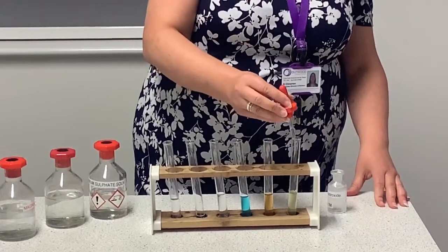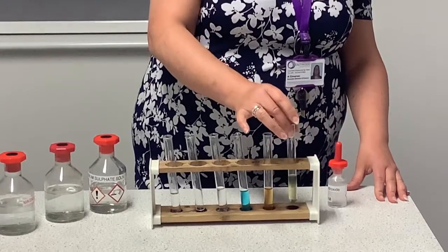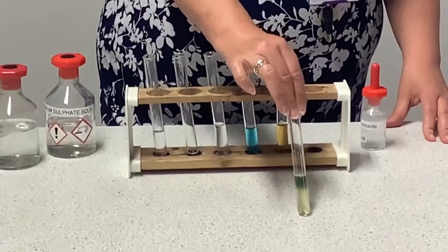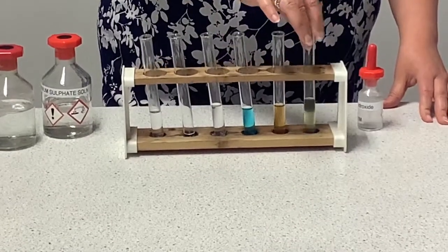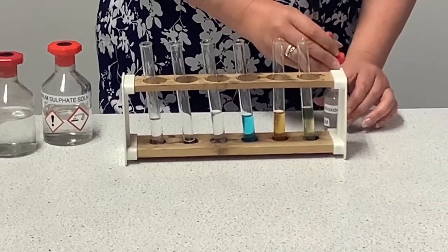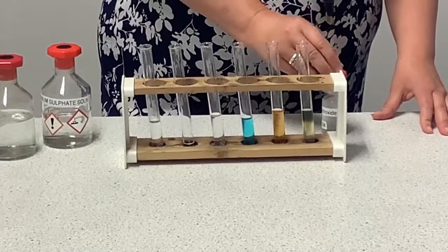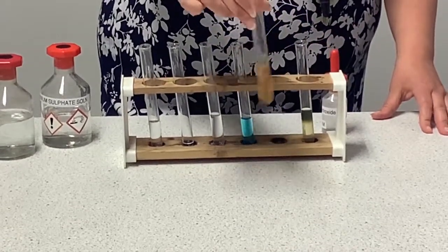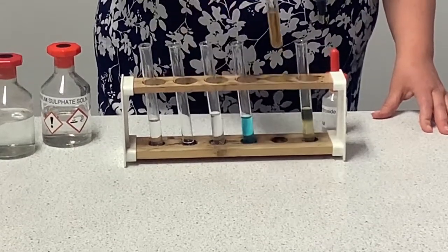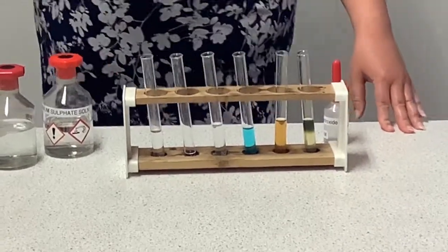So this one is iron 2, and you can see there very clearly that a green solid precipitate is formed inside of the mixture when we've added the sodium hydroxide. That's a positive test for an iron 2 ion. And then we're going to do the same with the iron 3, the 3+ ion. In this situation, we've still got a precipitate forming, not so clear, but it's an orangey brown precipitate forming there. So that allows us to differentiate between the two types of iron ion.